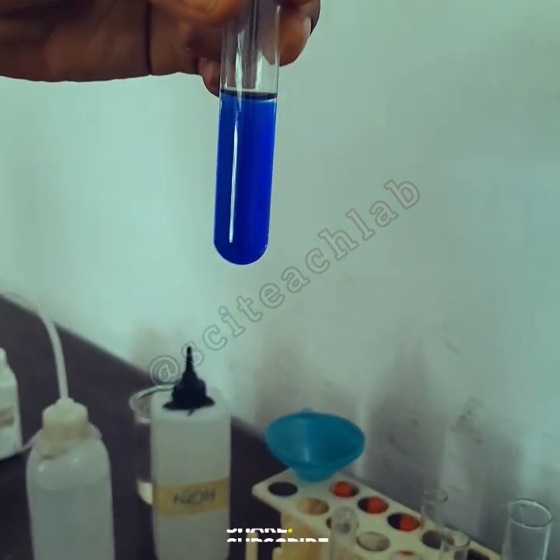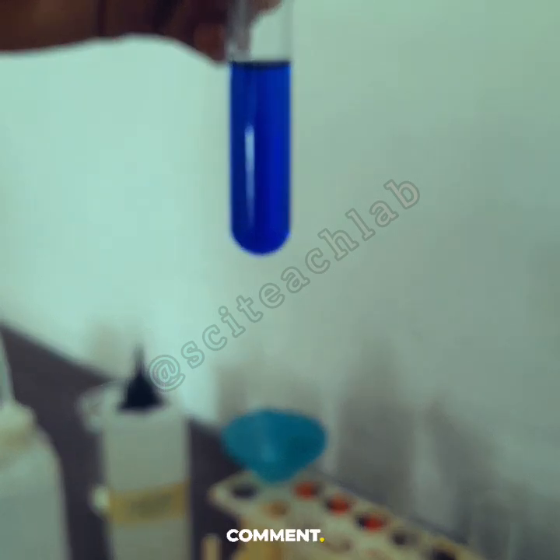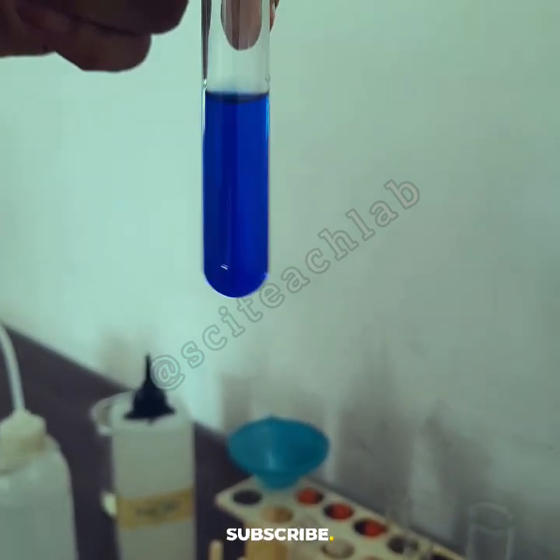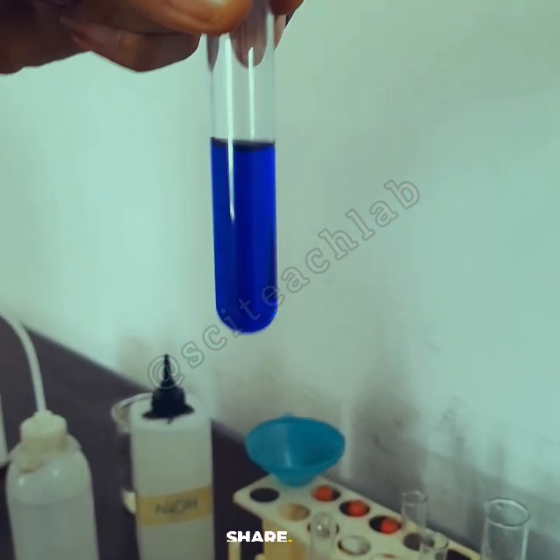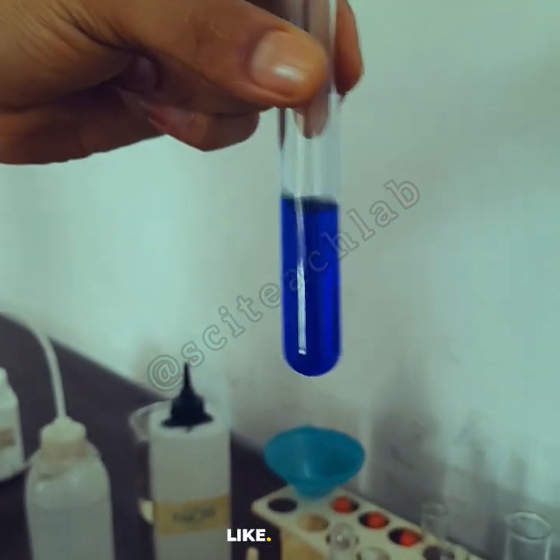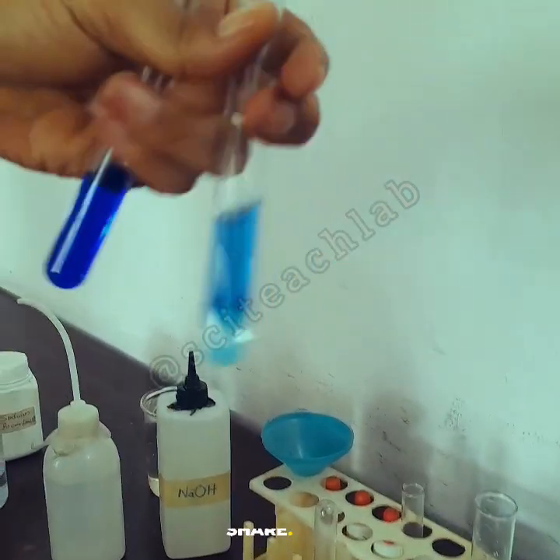I don't even need to add more, but since it says excess, I add a little more, and you see it's a clear solution. So that means that the precipitate could not dissolve in drops, but dissolved in excess ammonia, forming a deep blue solution.